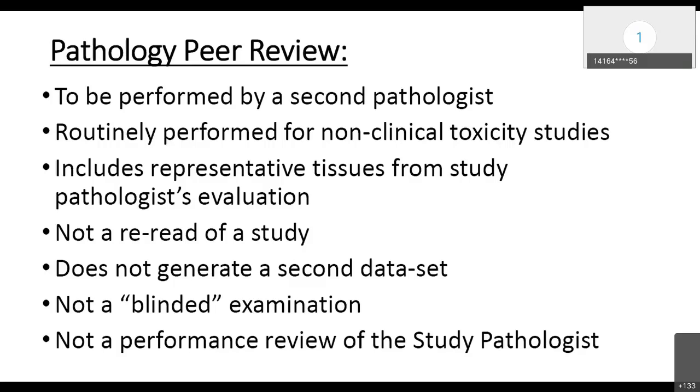And many times it happens that, especially for a junior pathologist, when peer review is to be done, they undergo a kind of anxiety or agony, thinking that it's going to be a part of their performance review. So it is not so. It is not a performance review of a study pathologist. Next one, please.